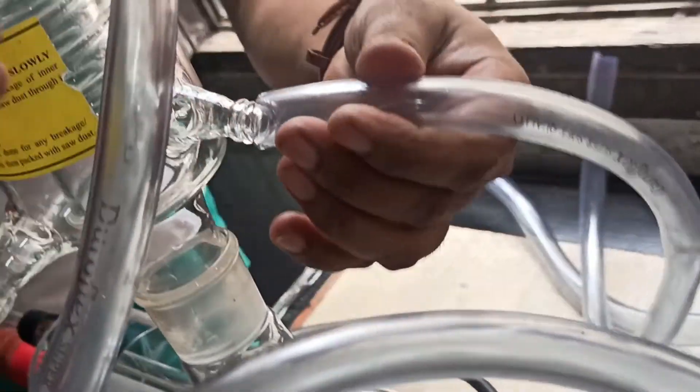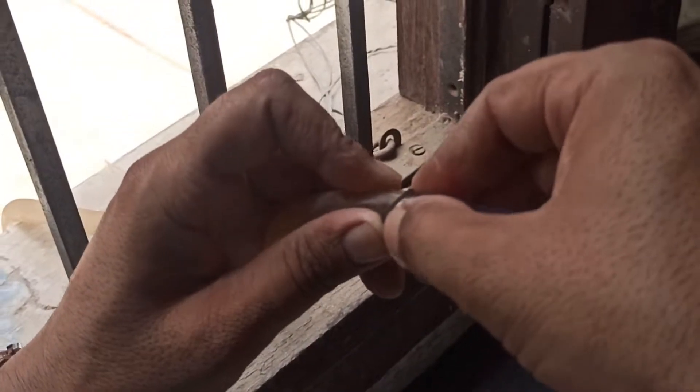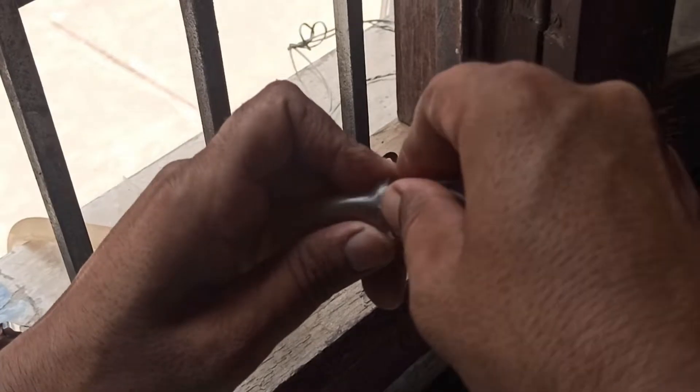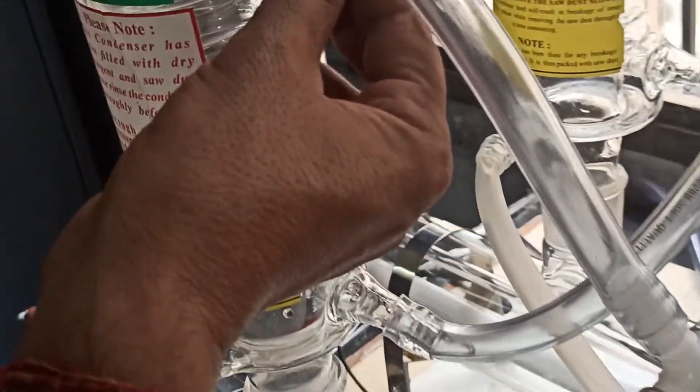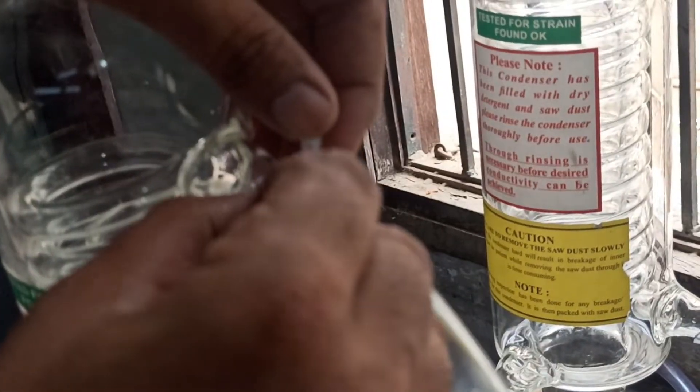Connect the inlet water supply to the inlet point of the first stage condenser. Connect all the PVC pipe points with the tie locks.